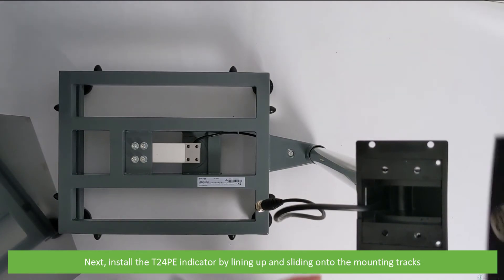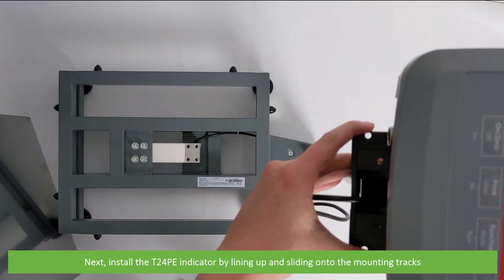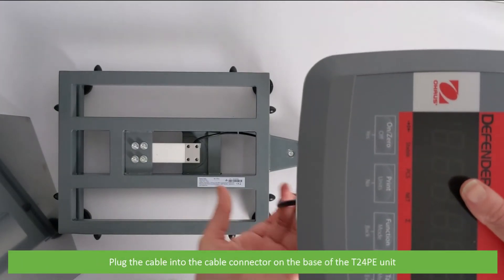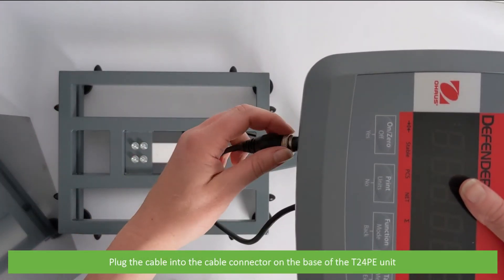Next, install the T24PE indicator by lining up and sliding onto the mounting tracks. Plug the cable into the cable connector on the base of the T24PE unit.